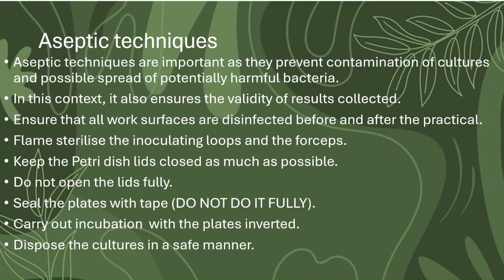Seal the plates with tape, but do not do it fully as that can encourage anaerobic respiration and harmful bacteria end up growing. And you do not want that. Carry out incubation with the plates inverted and dispose of the cultures in a safe manner. And you'll receive guidance on this from your lab support.